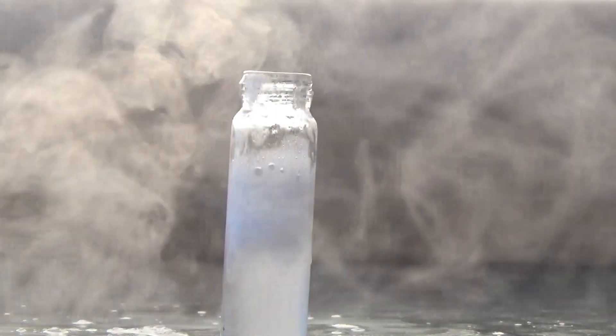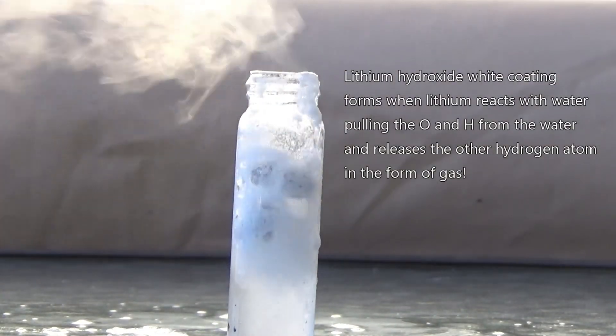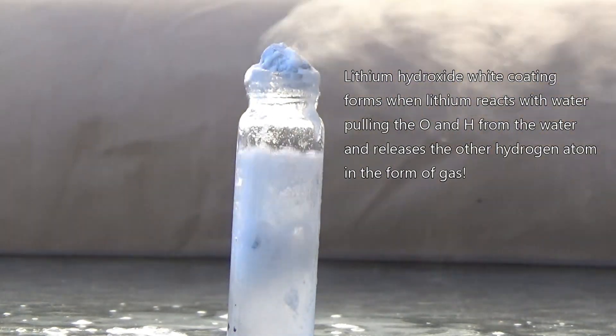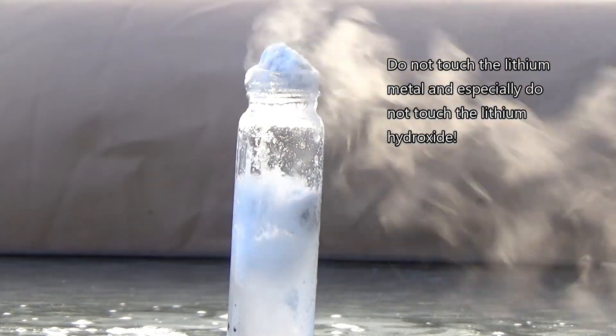When lithium is placed in water it releases hydrogen gas and lithium hydroxide. Lithium hydroxide is the weakest of the alkali metal bases and it is a white substance. Make sure you wash your hands after handling lithium, and do not touch the lithium hydroxide, which will also be dissolved in the liquids it is placed in.